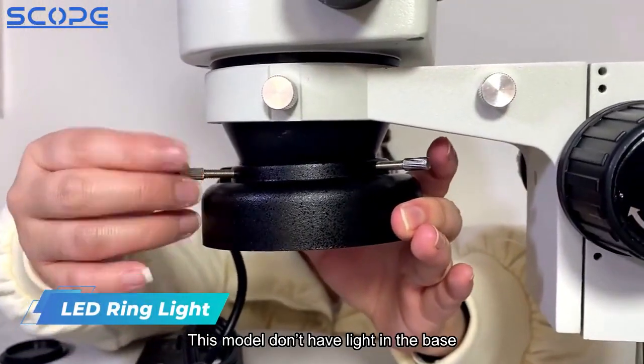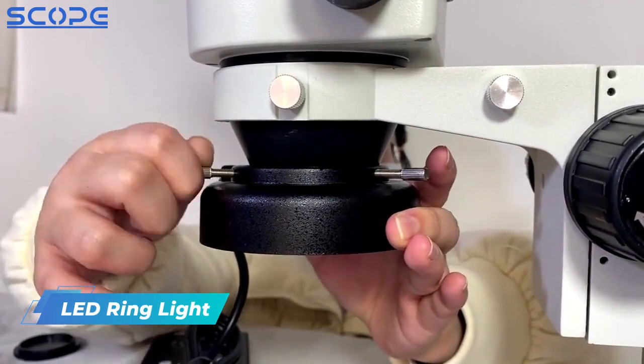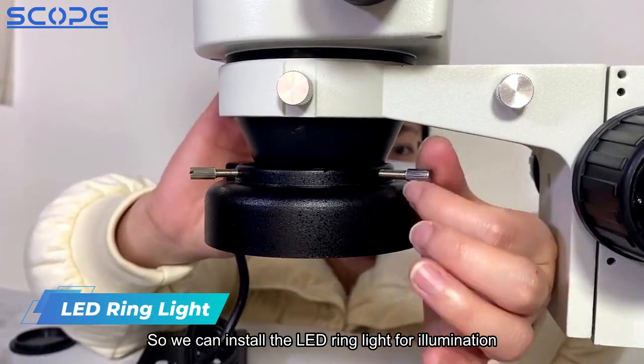This model does not have a light in the base, so we can install an LED ring light for illumination.